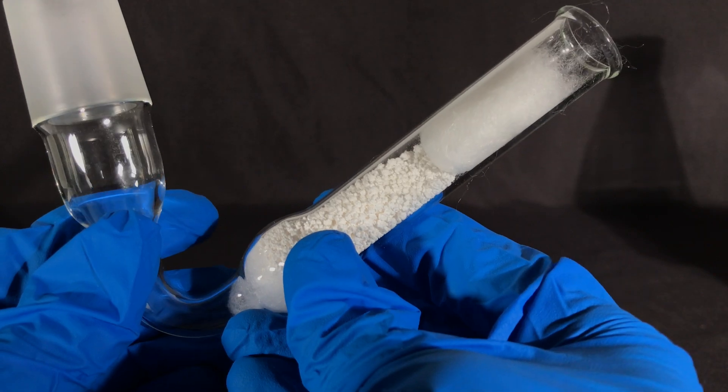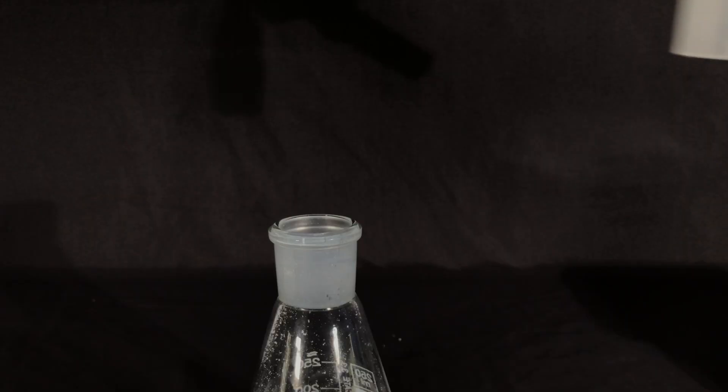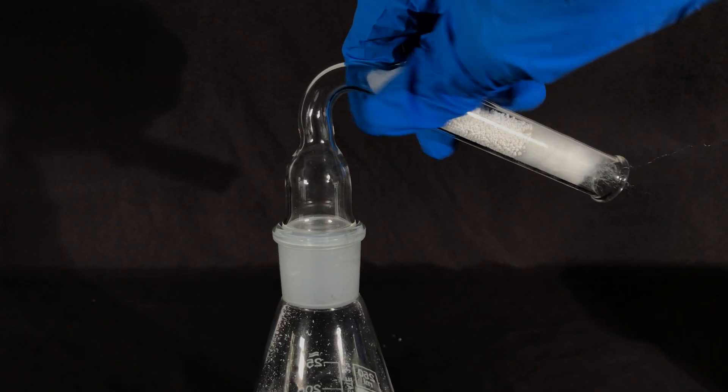We don't want the oxalic acid to suck up water again, therefore we added a drying tube containing anhydrous calcium chloride.